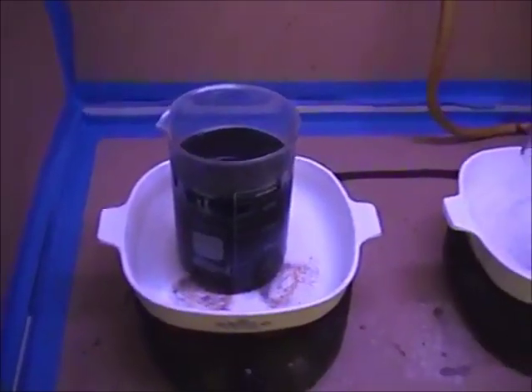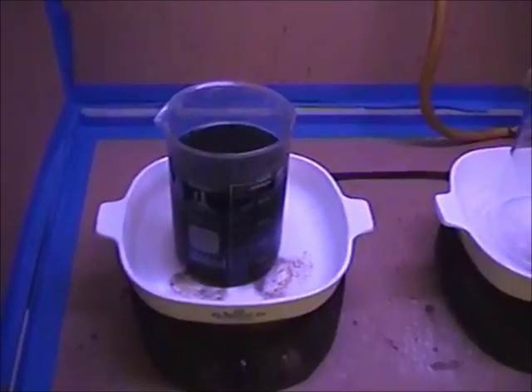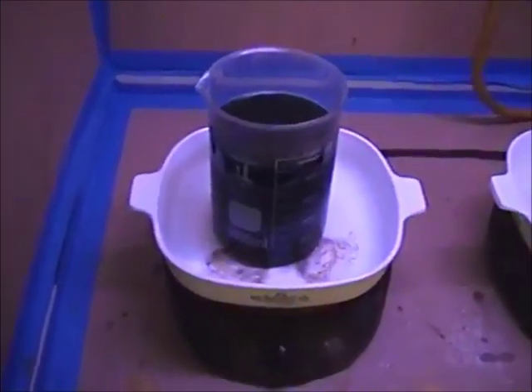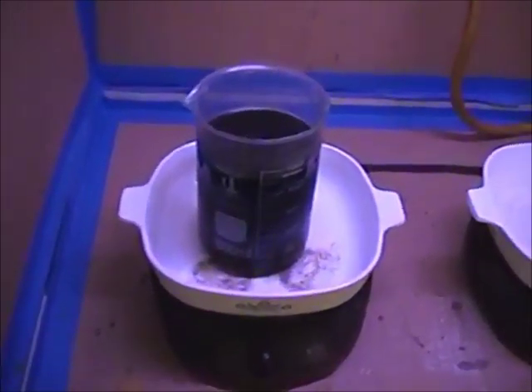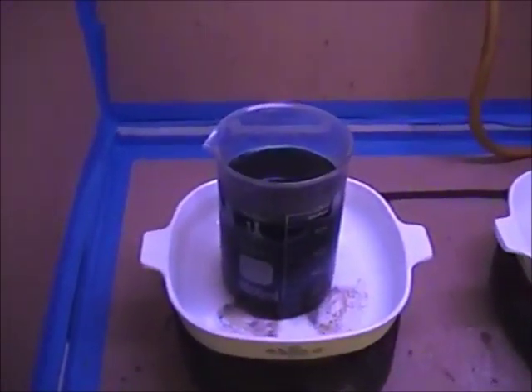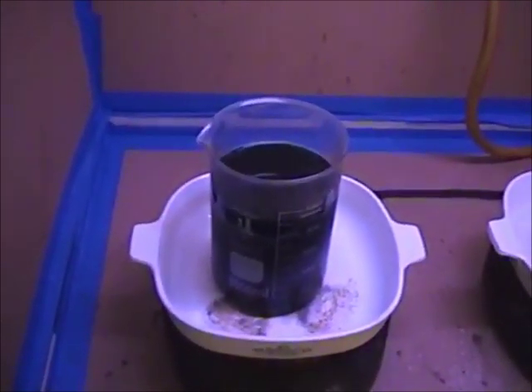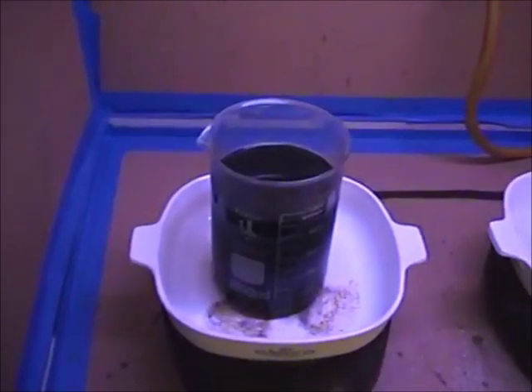Well, that's great if you know how much silver's sitting in front of that beaker in there, but we don't know that. So there's ways that we can test that. What we're going to do is add sodium formate and reduce the silver, and we're going to periodically check until we find out that there's no more silver in that solution. And we have a test for that. It's just a chloride test.